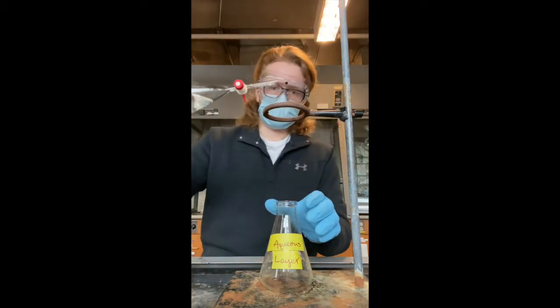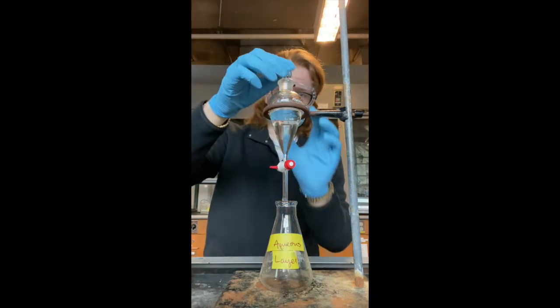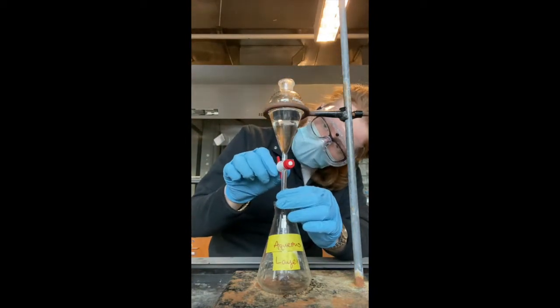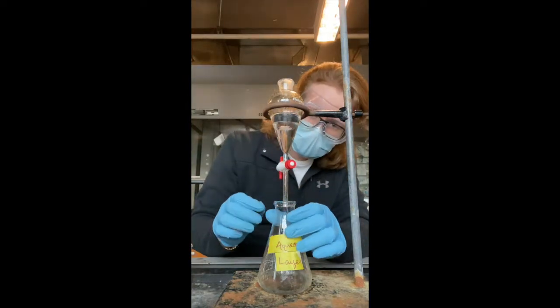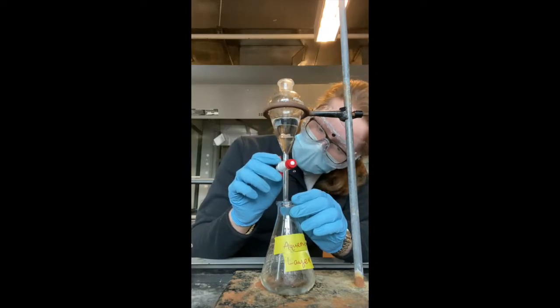At this point, you will proceed with the draining of the aqueous layer and the pouring out of the organic layer. Just as before, you will take out the glass stopper to drain out the aqueous layer into its Erlenmeyer flask, stopping right at the meniscus to ensure that none of the organic layer is drained out of the bottom, and then finish by pouring out the organic layer from the top of the separatory funnel into its Erlenmeyer flask.